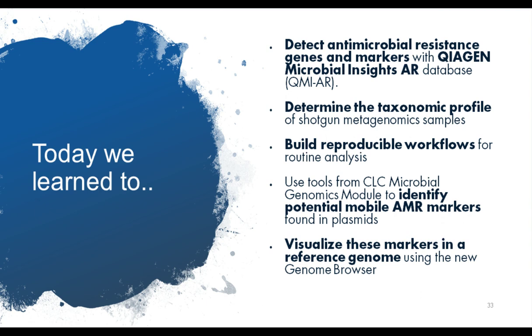So today we reviewed how to use the QIAGEN Microbial Insights AR Database and the CLC Genomics Workbench with the Microbial Genomics module to detect antimicrobial resistance genes and markers from clinical patient samples that were publicly available. We determined the taxonomic profile of these samples that were shotgun metagenomic samples.